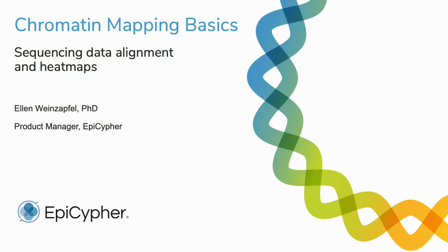In our recent chromatin mapping series, we explained how chromatin mapping data are aligned to the genome to create sequencing tracks. But there are other ways to visualize these data. Here we will discuss how to interpret sequencing heat maps.